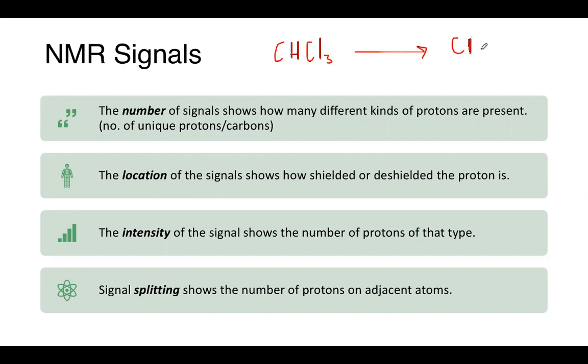So we deuterate this chloroform. One of the reasons why it's chosen is because it's a good polar organic solvent, and it only has one hydrogen. So it's easy to remove this hydrogen and replace it with deuterium. The reason why that is done is so that we don't get a spurious signal from this, which would kind of confuse our regular hydrogen spectrum.